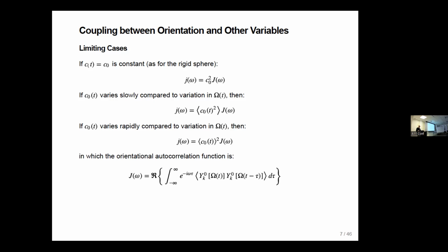And if the ring flipping is slow, this says we should average the square of the C's. C depends on 1 over R cubed. So this says we should average 1 over R to the 6th. So we take the two distances to the two paras and average them as 1 over R to the 6th for the one plus 1 over R to the 6th for the other.